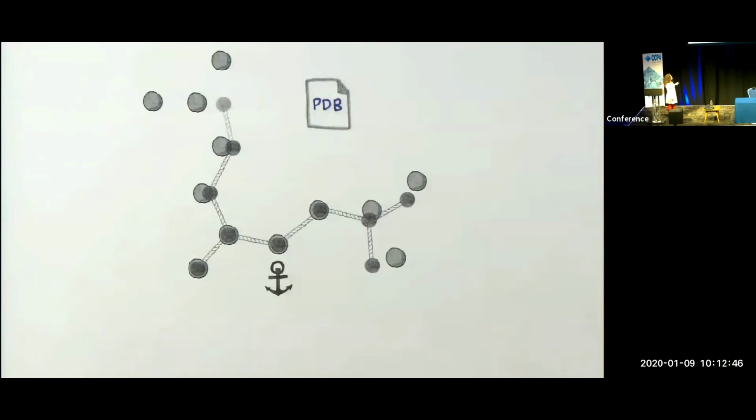So what you can see is that because the bond lengths and angles are fixed to an exact value, that value is actually the empirically derived values in the literature, and this means that there's an error that gets introduced at every step, and then as you go along the chain goes off course, which isn't very helpful, so we need to adjust the torsion angles and the parameters that we can use in order to bring that back onto the original path from the PDB file.